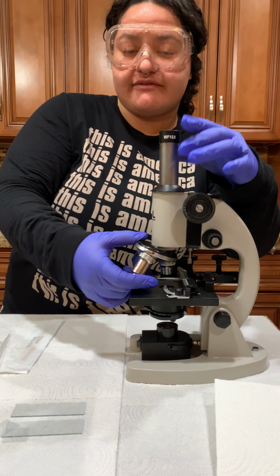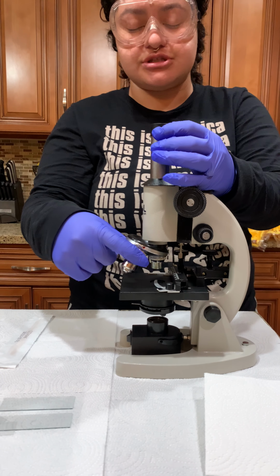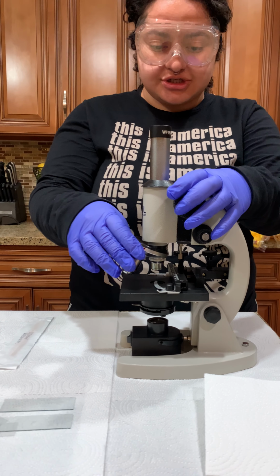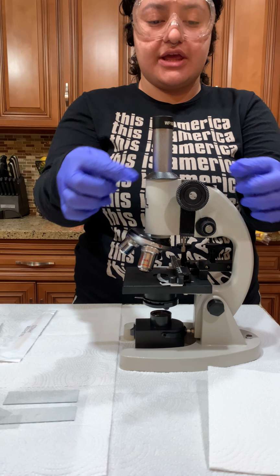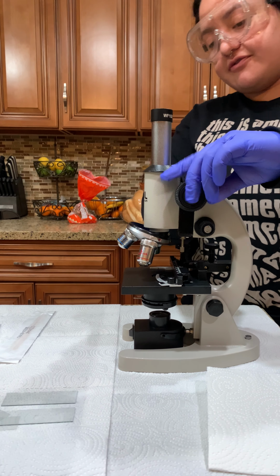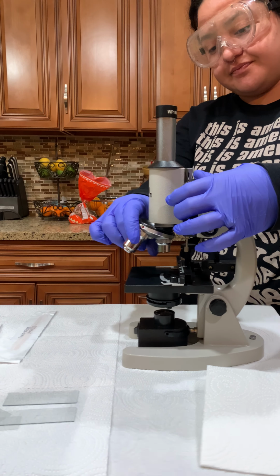To determine the total magnification, you use the 15x of the ocular lens and you multiply it by the magnification of the objective lens to get your total magnification. And then right here we have the coarse focus knob. So this allows for you to focus on a bigger picture. You can see it kind of moves the big portion up and down.